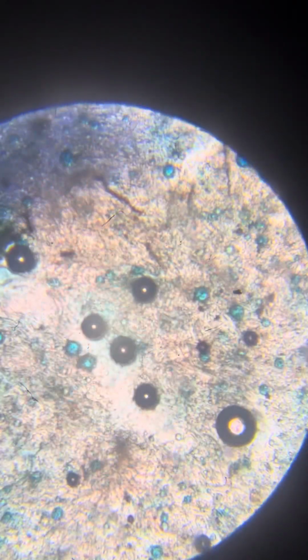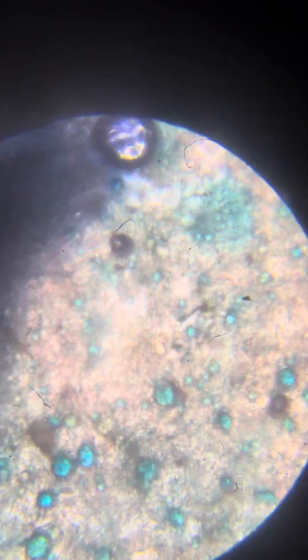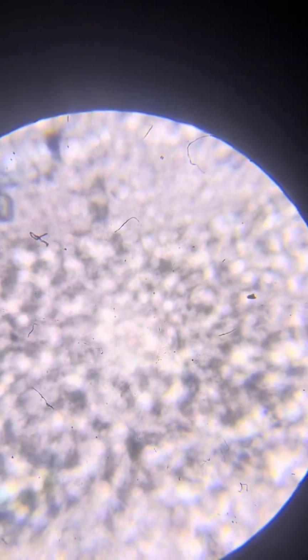We see many fat ones, which is good. Huge ones, fat ones, big ones, everything. Very nice, very, very nice. Wow, what an impressive slide. Let's get back to 64. I want to see, no.